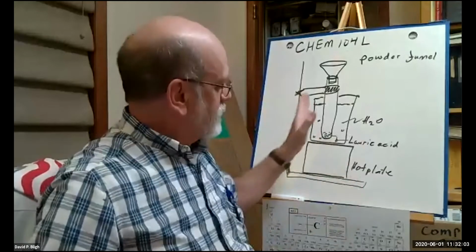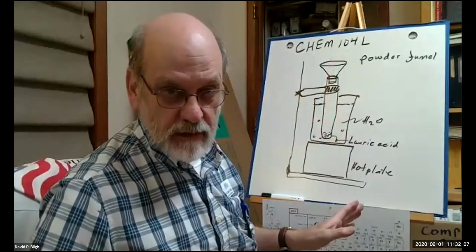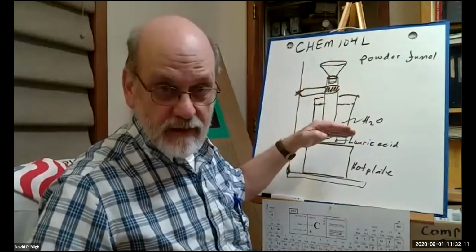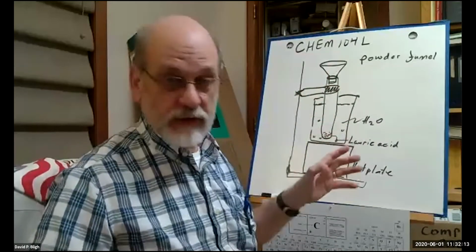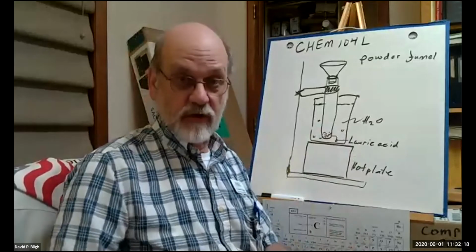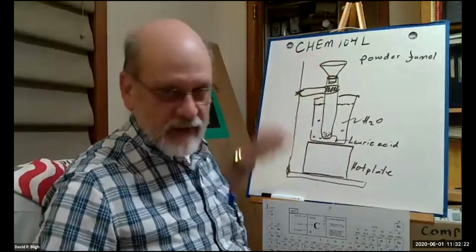Why? So that we get as much of it as possible in the bottom. If you don't have lauric acid below the water line and it's heating up, then it'll never turn into a liquid and you have a source of error, right? So there's one possible source of error. You don't get all of your material in the bottom.